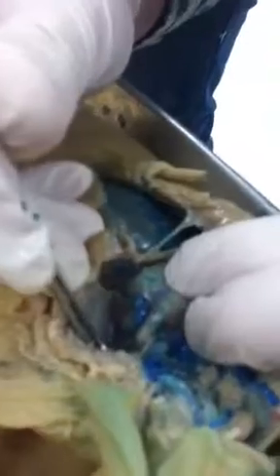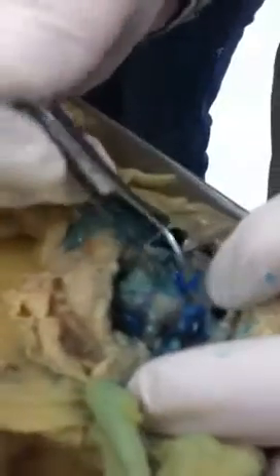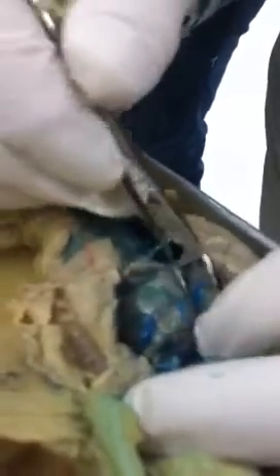Now, where's that part that you said goes away after a certain age? That was the thymus. No, it was the duct, and it's right kind of where the pulmonary trunk and the aorta cross, right in here. We'll try to get that out later. And you said it later turns into just an artery, right? Or what is it? A ligament. A ligament, that's what I meant.